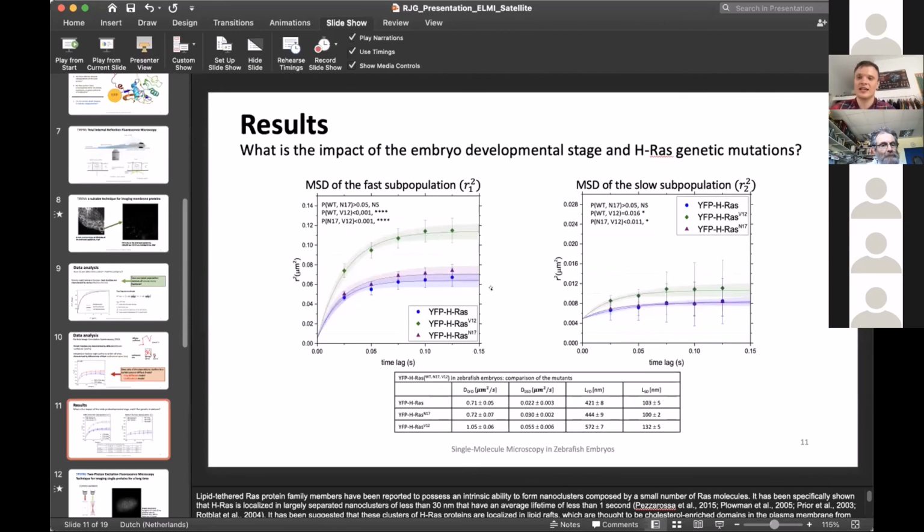And I agree with that. In principle, it should be possible to see that. Maybe not at a certain time lag, because when we have to image two colors, we have to switch the excitation beam, and that makes the measurement a bit prolonged, so not 25 milliseconds. So there's always some trade-off. But that would be definitely possible, for example, with two-photon, to see what happens with the two colors. It will be switching between 1 and 2, so it won't be at the same time, but maybe there's something that could be done there. Yes, I agree with that. Okay, thank you.